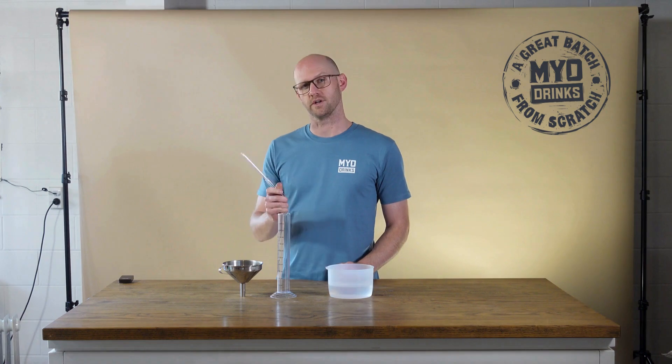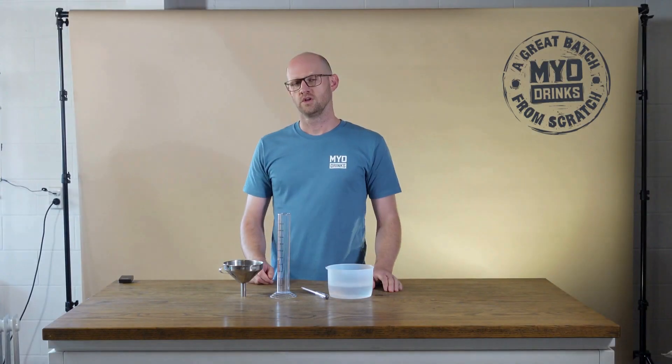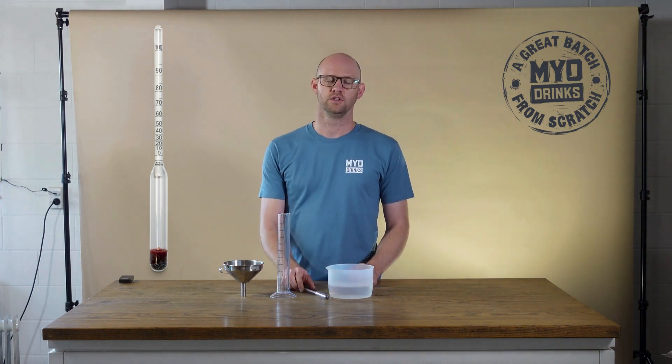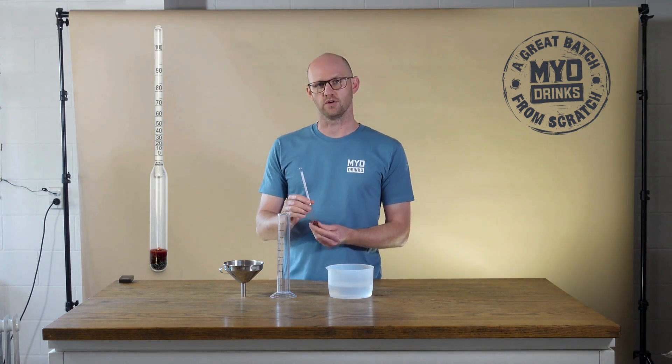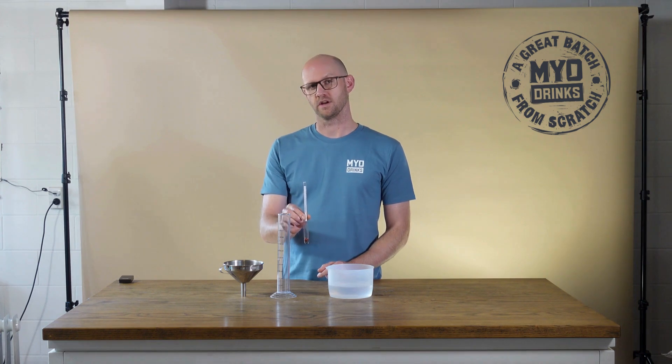So let's talk about alcometers. An alcometer is an instrument used to measure the percentage of alcohol in a spirit. Alcohol is less dense than water, so the alcometer will sink as the percentage of alcohol increases in your spirit.